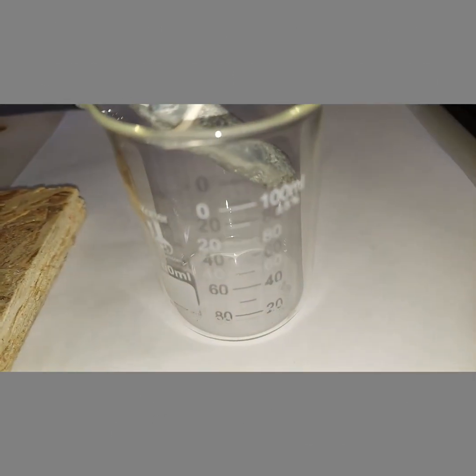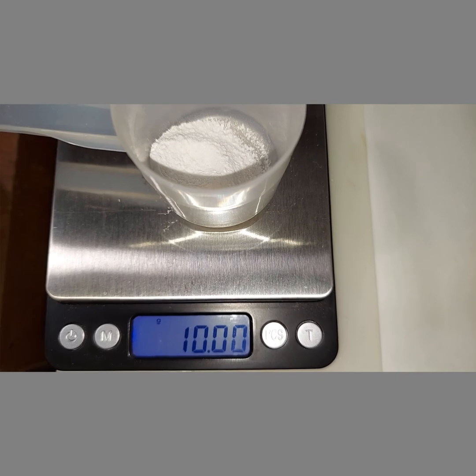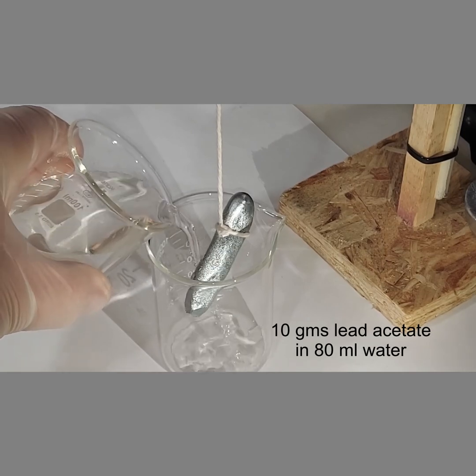I tied the zinc rod so that the squared end falls below the 80 milliliter mark, which we know will be the lead acetate solution. Here's our 10 grams of lead acetate which we made earlier. I pre-hung the zinc bar in there and I am now going to pour the lead acetate solution in.